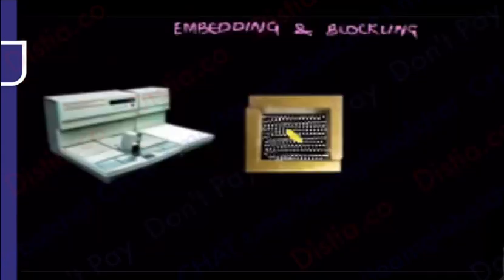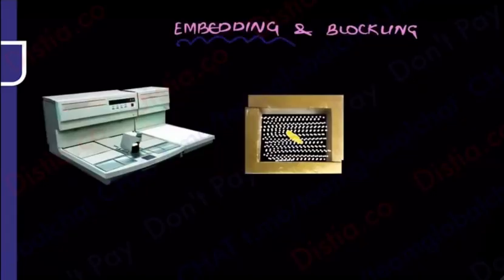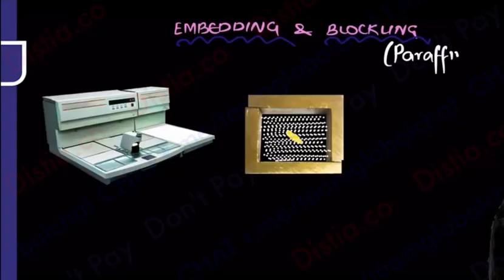Are you all clear with what was embedding? Embedding was putting the tissue in that L mold and putting wax. So you embedded it, like you put a seed in the soil. Same way, I'm putting my biopsy in the wax. And after that, you're ready with the block. Everyone could see that paraffin block, everyone could visualize the paraffin block very, very carefully.